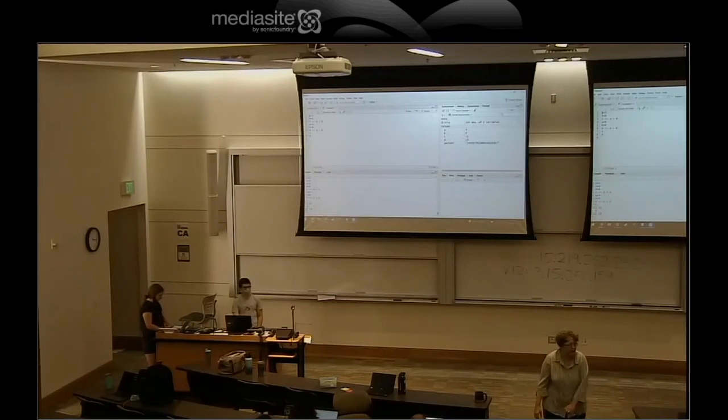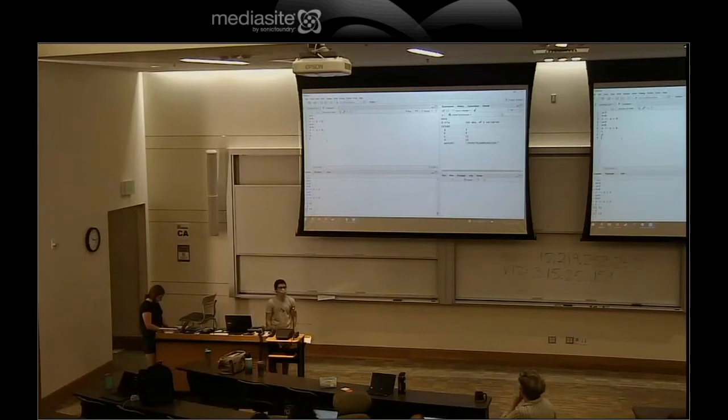Okay, sorry to interrupt, but a lot of people are having that confusion. If she hasn't run D yet, if she has not run line 6, and she types D in the bottom, what will the bottom say? Yes, exactly. If you haven't set D, it will say, you didn't set D, you didn't run it.